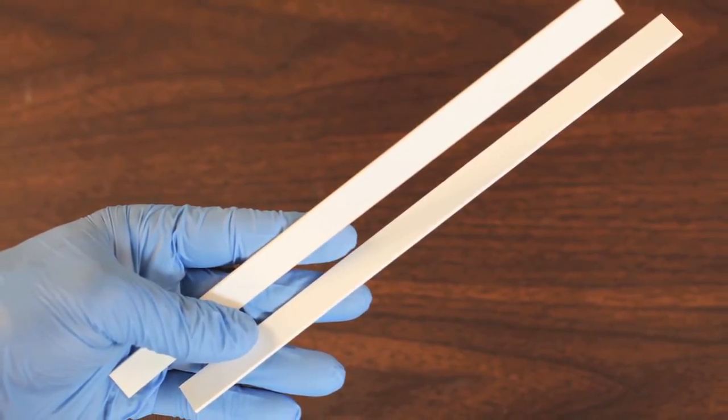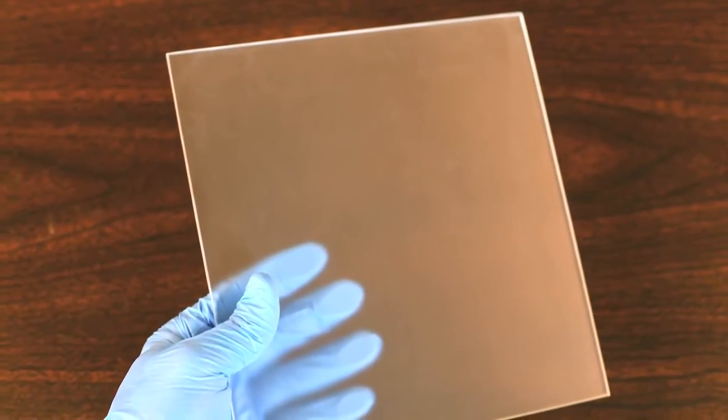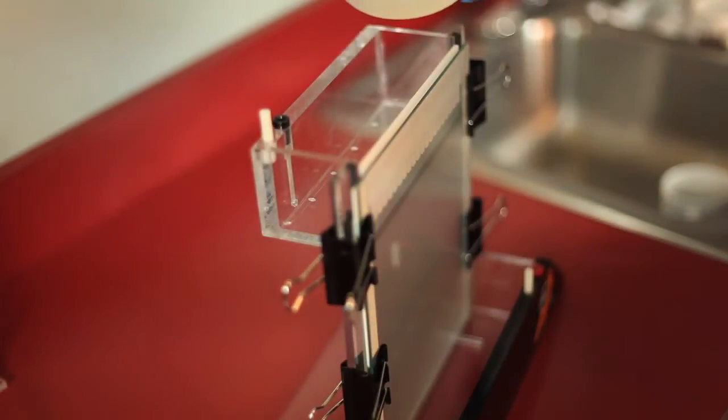Useful in a variety of applications, the included frosted glass plate allows for casting agarose gels. The 0.8 mm gel thickness provides uniformity of thin vertical gels.